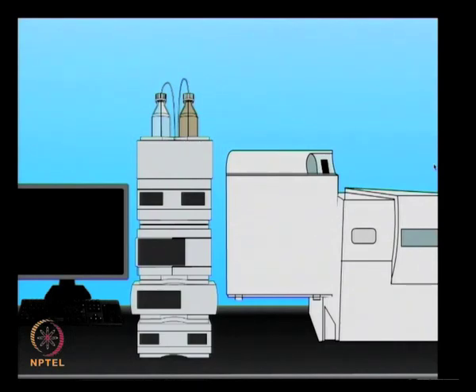So, compared to conventional nanospray techniques, this technology can achieve maximum sensitivity with minimum sample size by integrating sample preparation, separation and electrospray tip on a single chip.